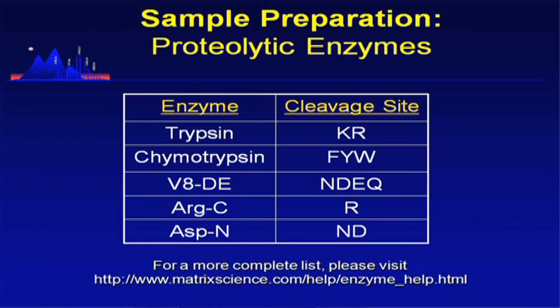For example, in my lab, we do a lot of histone work. And so we're doing analysis on histone acetylation, which is on lysines. And so trypsin is not very good at cleaving at lysine if it's modified, but it will sometimes cleave. So it confuses the analysis. And so we routinely use ArgC for histone proteins when we're specifically looking for lysine acetylation.